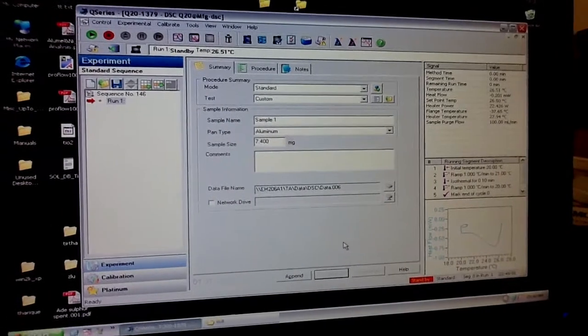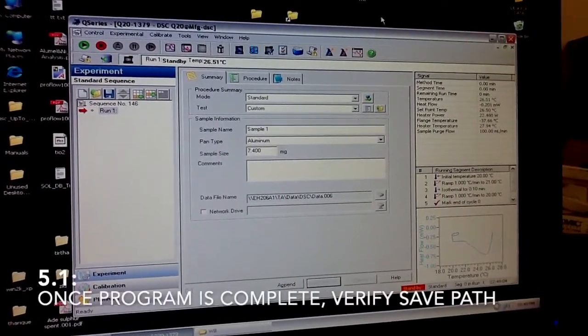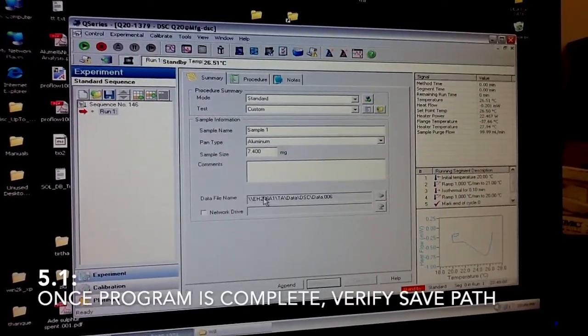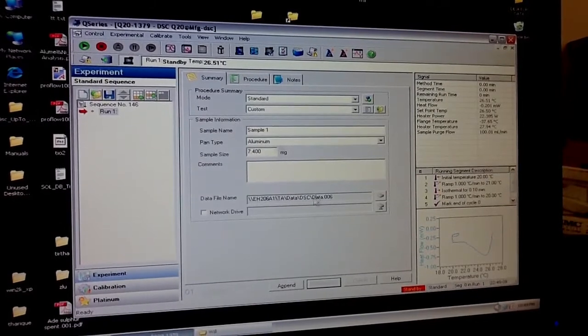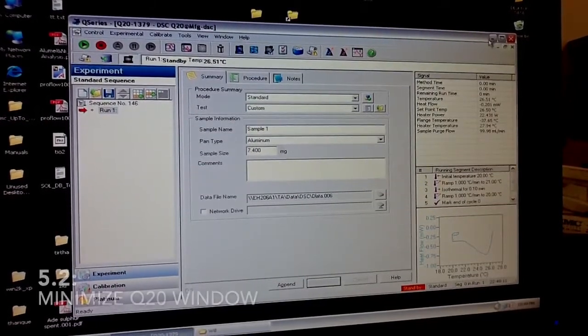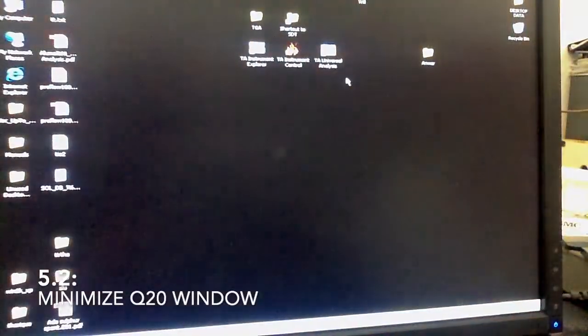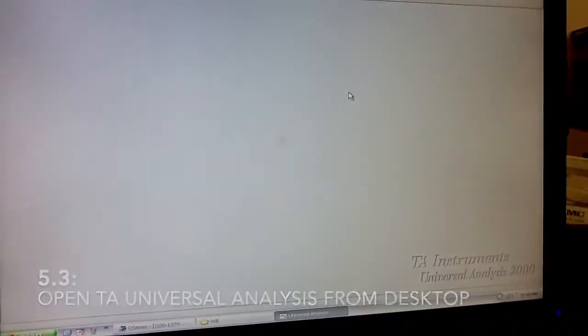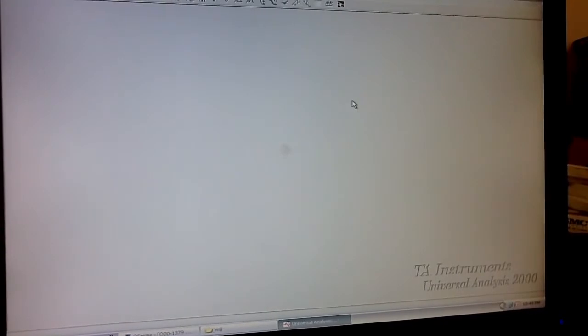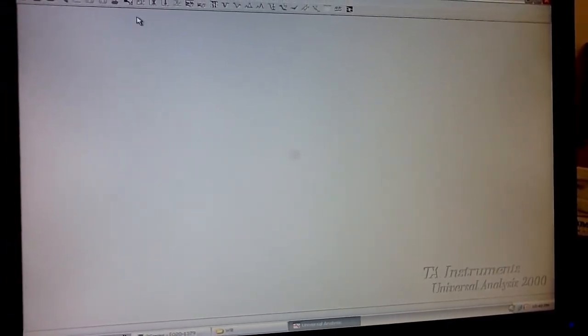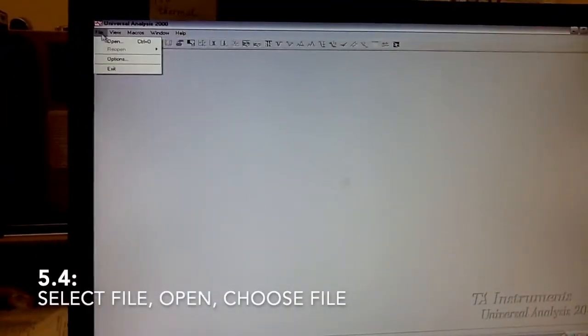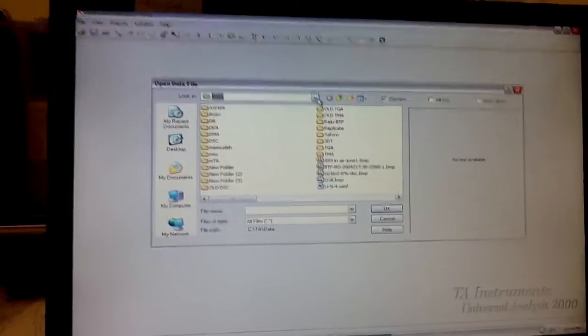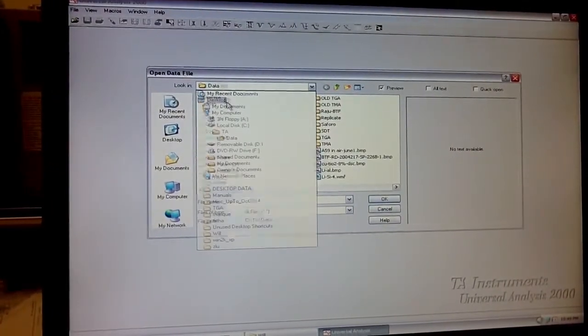So our test is complete. When you come back, it should be saved automatically in the spot that you indicated here. Once you have it, you can come to this software, TA Universal Analysis. And you can open the file from wherever it was saved.